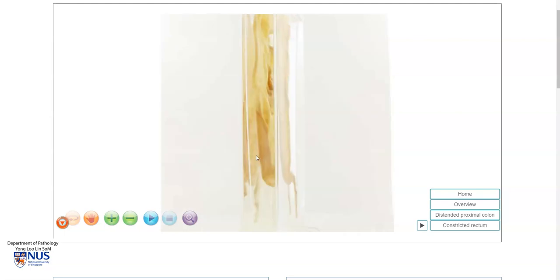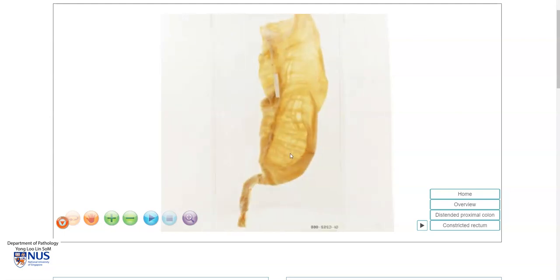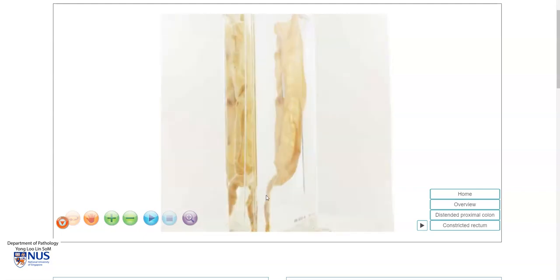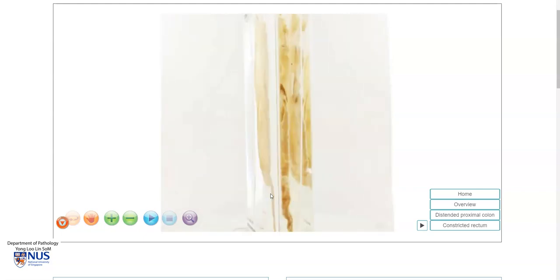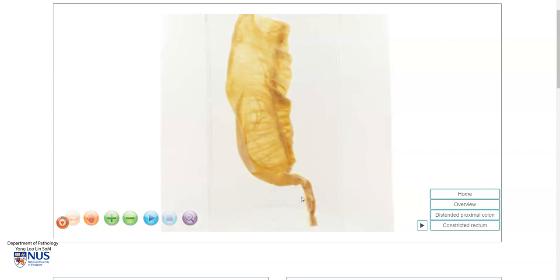Turning this around, we can see how thin the wall is. There is no evidence of perforation. So let's learn a little bit about Hirschsprung disease.